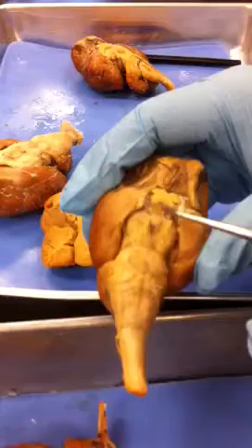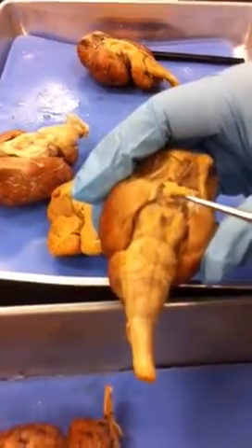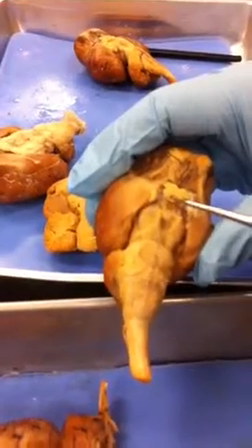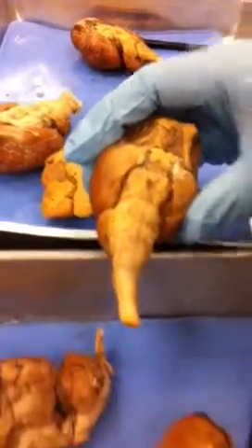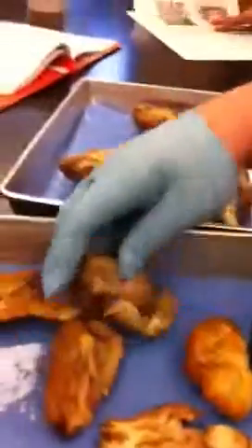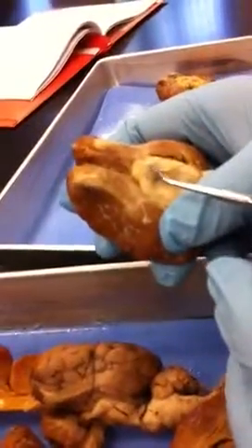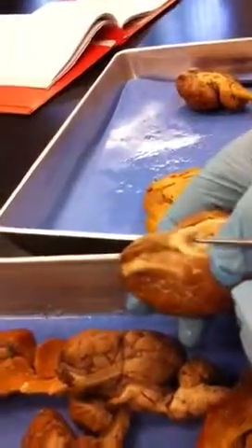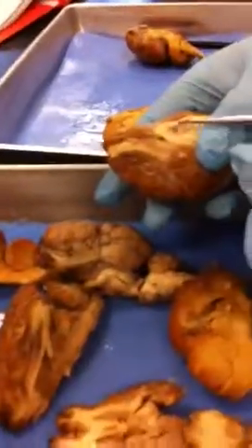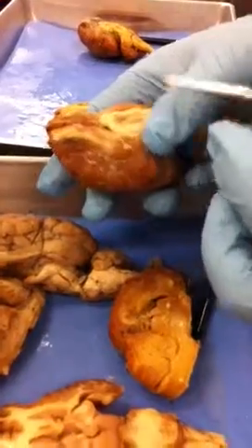This dark part is the pituitary, just below the optic chiasm. So remember, you had a hypothalamus down underneath of this optic chiasm. Just caudal to that is where you find the pituitary gland, and it usually kind of hangs off. Try to find a better one. There's another one right there. See that dark spot? That's actually a gland. That's the pituitary gland right there. There's some more mammillary bodies right there, kind of chewed up.